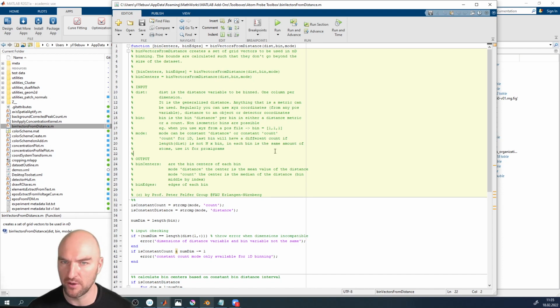So if you want to make a proximity histogram, for example, where you make sure that each bin has the same number of counts in it, just imagine you have a highly curved surface, or something close to a dataset edge. Especially with precipitates, which are highly curved, the data becomes very noisy when you get to the inside of the precipitate, because if you go by distance, the number of atoms in your last few distance bins is extremely small, so you get a lot of statistical noise.